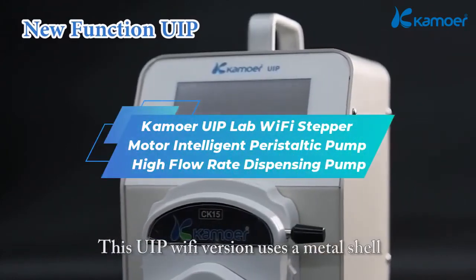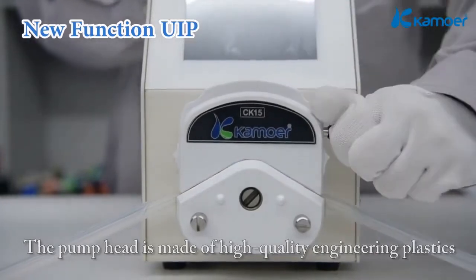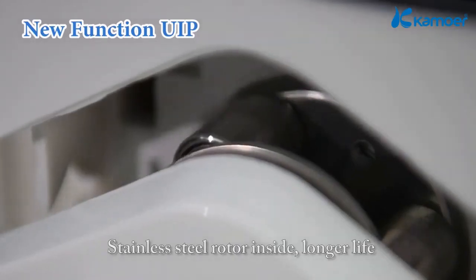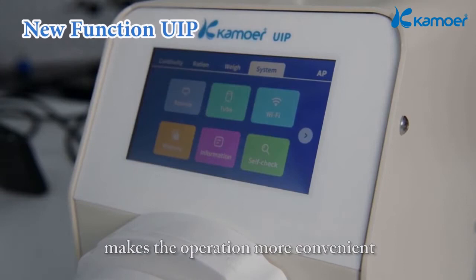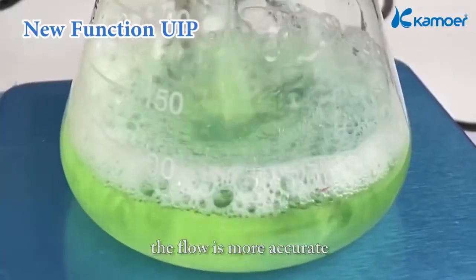This UIP Wi-Fi pump uses a metal shell. The pump head is made of high quality engineering plastics and stainless steel rotor inside for longer life. The smart touch screen makes the operation more convenient. The built-in weighing module makes the flow more accurate.